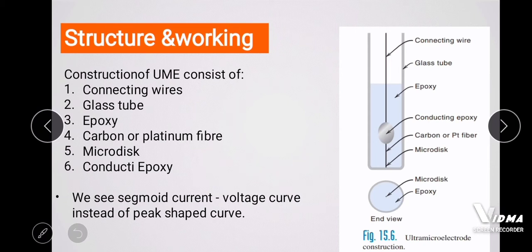Basically, they have high tensile strength, lower weight, high chemical resistance, high temperature resistance, and low thermal expansion. So that's why they are used. Then there is also a conductive epoxy. Conductive epoxy is epoxy with metal particles that can conduct electricity like glue. And they are microdiscs.